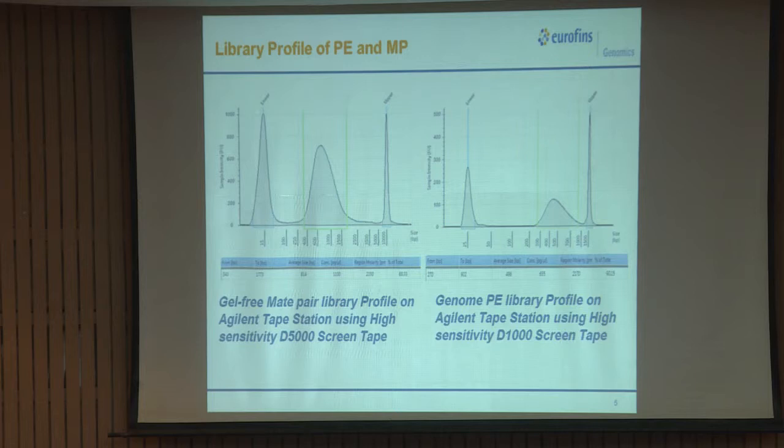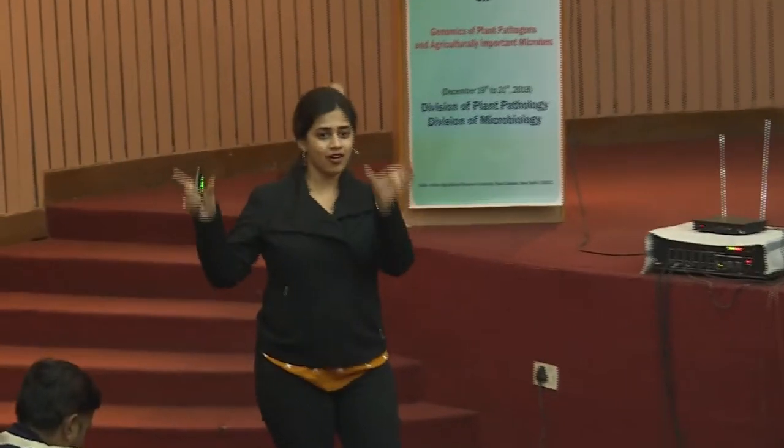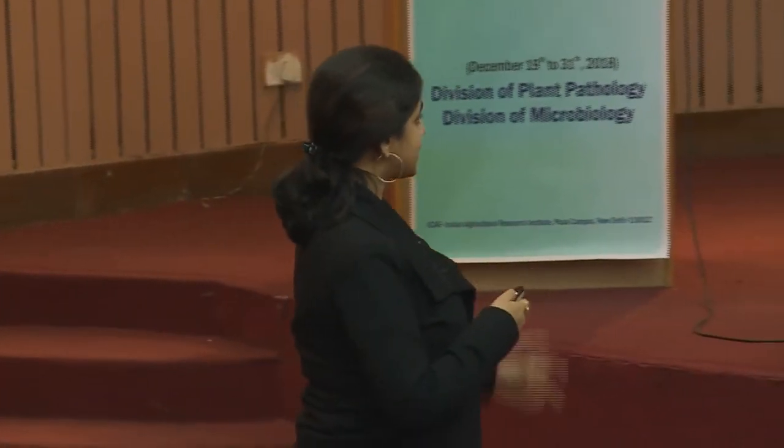So, when our assembler works, it will have an overlapping or this first R1 pair and will find that much distance in between and find the other pair there, right. That is how the accuracy works. So, both the reads will move in that particular distance. So, plus and minus standard deviation will be provided to the assembler. So, accordingly it will move. So, it is not a random matching of reads, it is an accurately matching of reads like this, moves like this, right. We will see how it is.